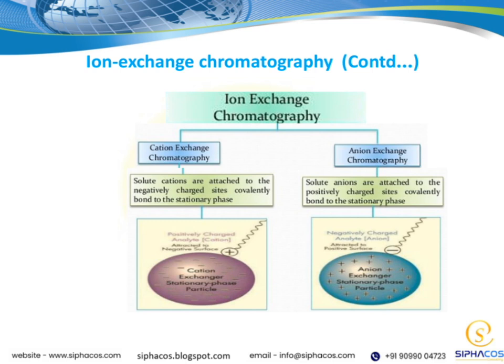The separation depends heavily on the charge properties of the molecules we're interested in, which makes this method incredibly versatile. It's also important to note that the process involves passing a mixture through a column packed with a resin, where ions are exchanged based on their charge interactions. This exchange can be influenced by factors like pH and salt concentration in the buffer, which we can manipulate to improve separation efficiency.